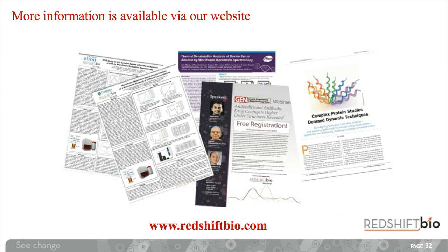Between replicates of the same sample, say prepared in the same well, the reproducibility will depend on your concentration, but we would expect approximately 98% at about 2 milligrams per mil. And I have seen incredibly high reproducibility at higher concentrations. For example, I've seen about 99.9% for a MAB sample at about 100 milligrams per mil.